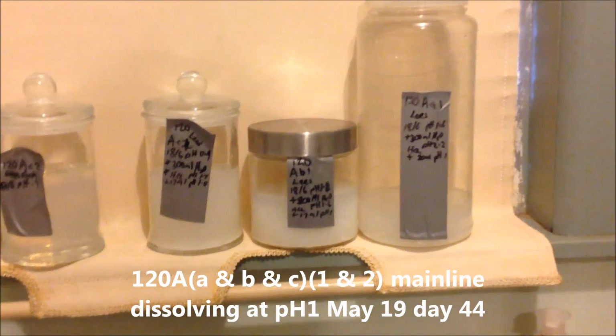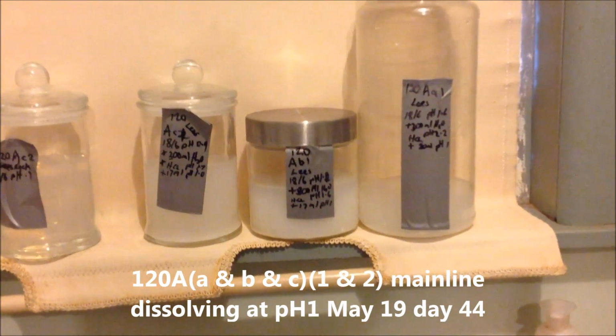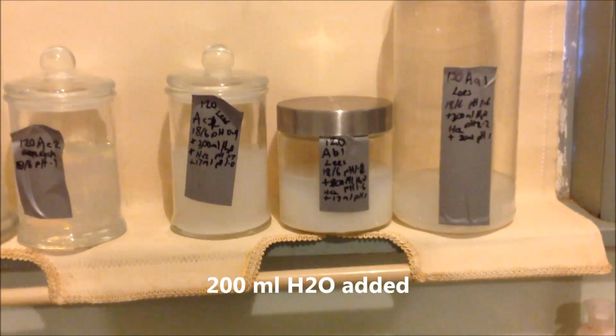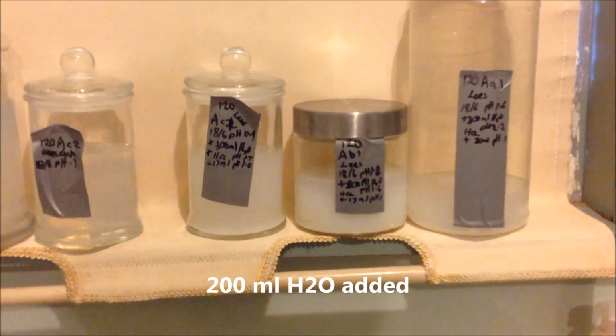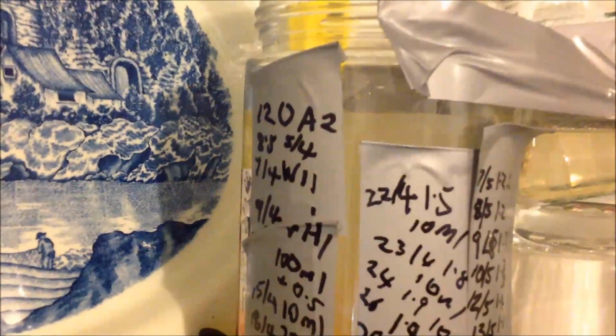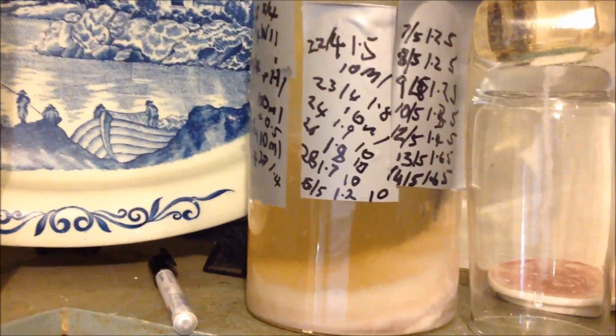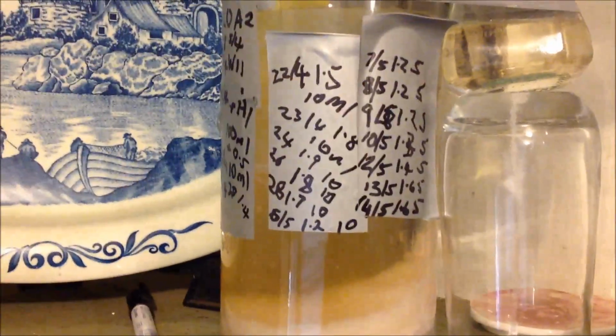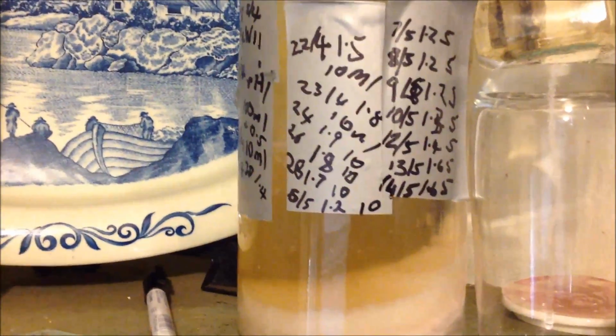24 hours later, the precipitate lees, 200 mils, maintaining pH 1, still in suspension, and there's 120A2, reconstituted nodule, taken to pH 1 and then trying to get it back up to 8.5. Today is the 16th, and last time I tested it was the 14th, that's why you can see 14 there.